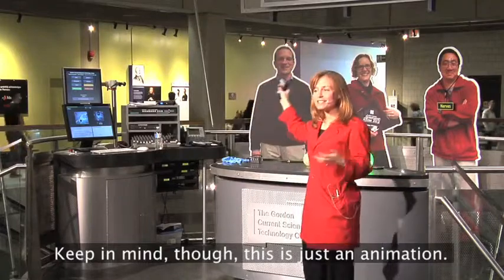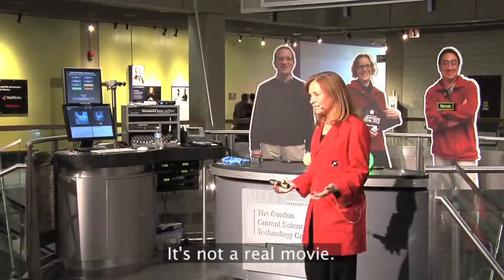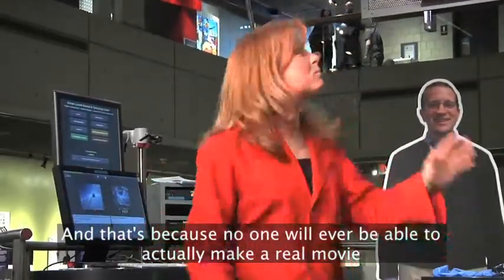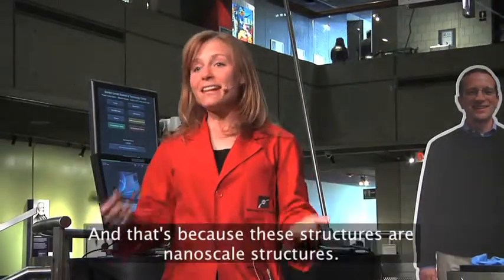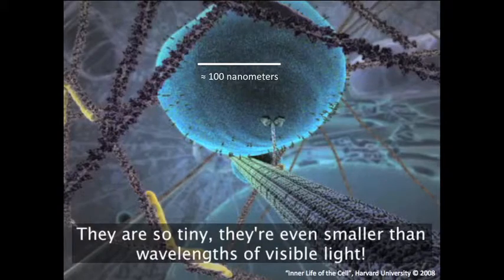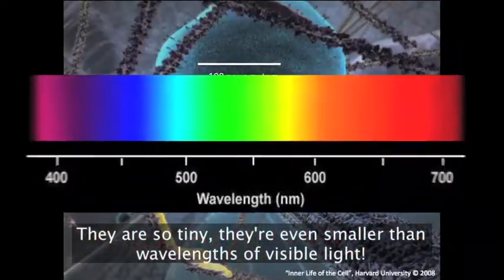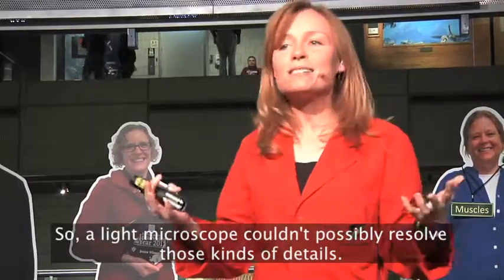Keep in mind though, this is just an animation. It's not a real movie. And that's because no one will ever be able to actually make a real movie at this level of detail inside living cells. And that's because these structures are nanoscale structures. They are so tiny, they're even smaller than wavelengths of visible light. So a light microscope couldn't possibly resolve those kinds of details.